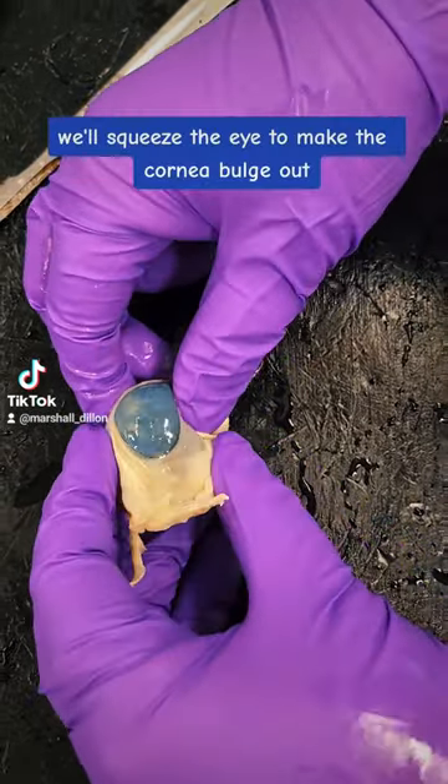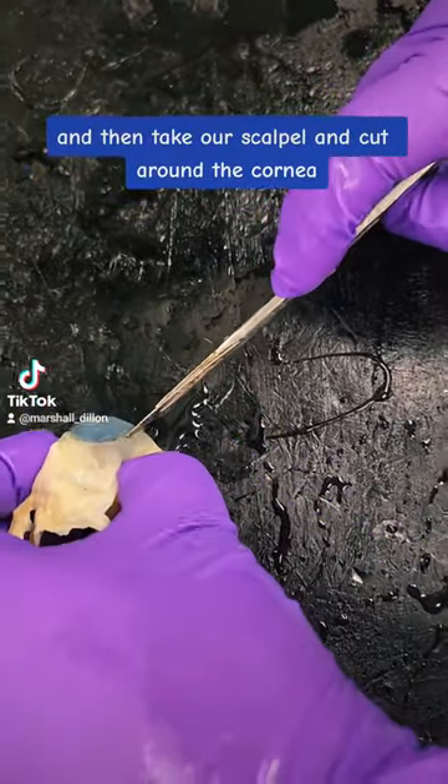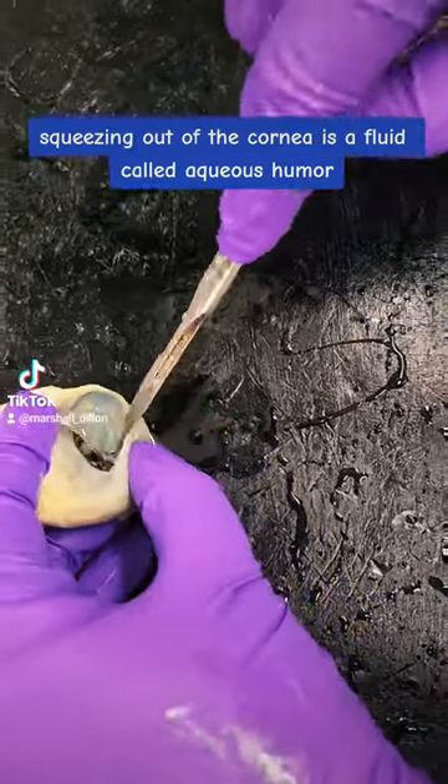We'll squeeze the eye to make the cornea bulge out, then take our scalpel and cut around the cornea. Squeezing out of the cornea is a fluid called aqueous humor.